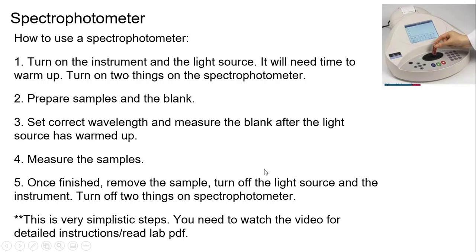Spectrophotometer. Now there are videos, and some of the lab does explain some of this, but like I said, I'm not as happy with some of these labs because they don't explain as well as they should. How to use the spectrophotometer.